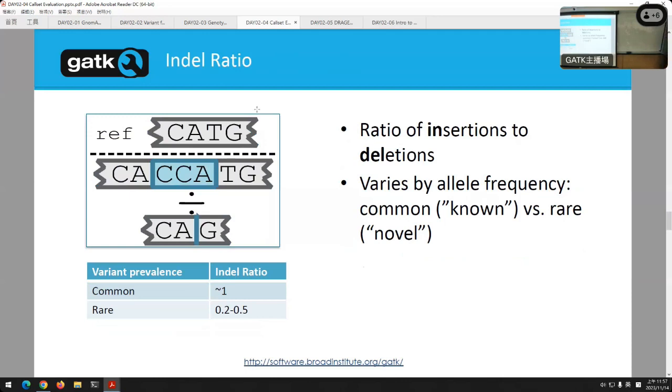Okay. And I should point out that all of these are just adding confidence to the fact that you have a good call set. I mentioned 4 specific ones here. These are like the minimum, in a real way. If you have better metrics for your particular case, I really do suggest you use them. But we also suggest at the very least, you can do something like these 4. All right?